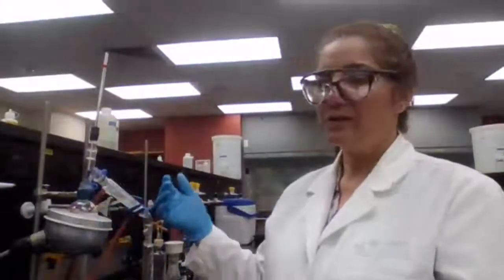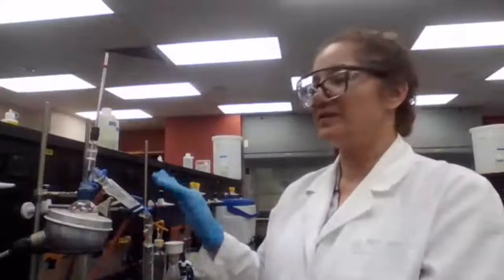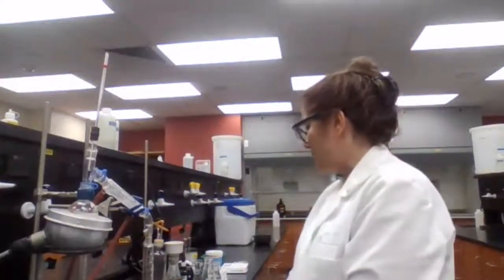At the beginning, you could set it at high to make sure it's boiling. As soon as it starts boiling, you can adjust the power regulator to a lower number to provide gentle boiling. And it has to be continuous boiling. We cannot put it too low, because if it stops boiling, then we don't have vapor to condense. We have to generate the vapor and condense the vapor.